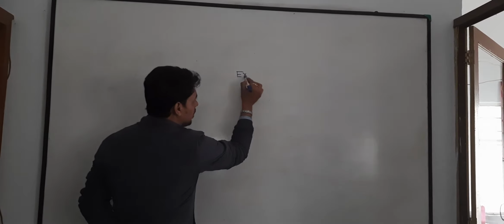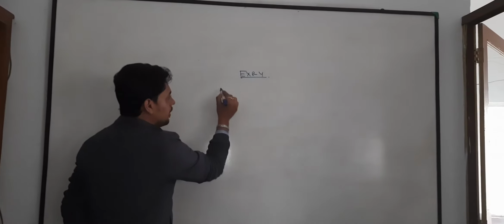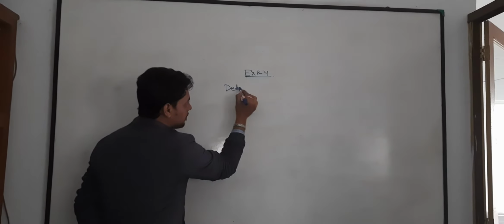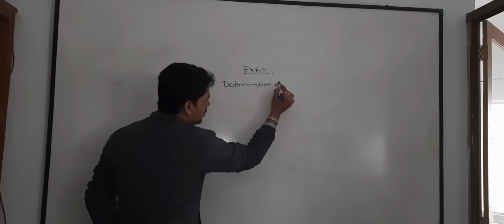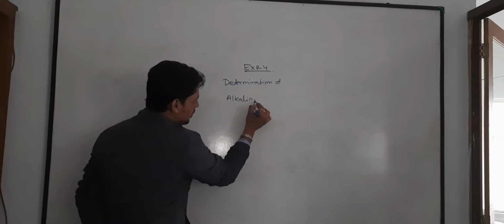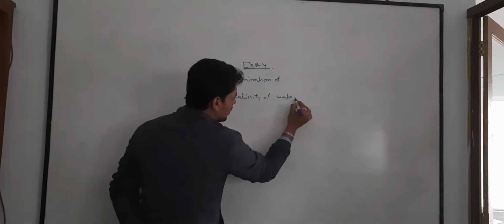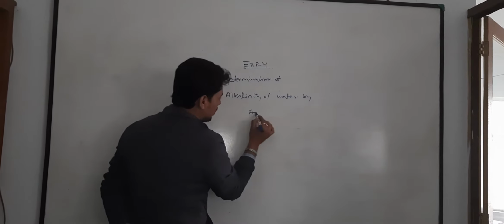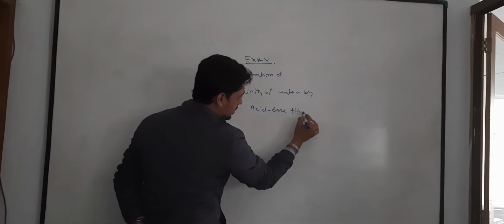Please write the heading of experiment 4: Determination of alkalinity of water by acid base titration.